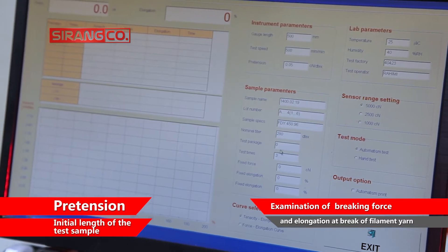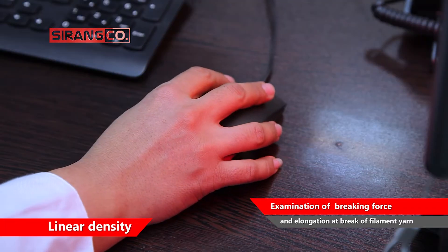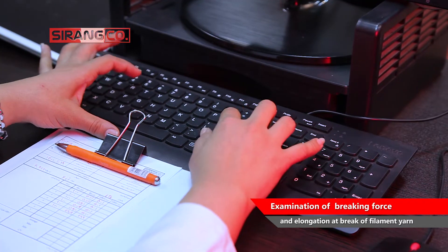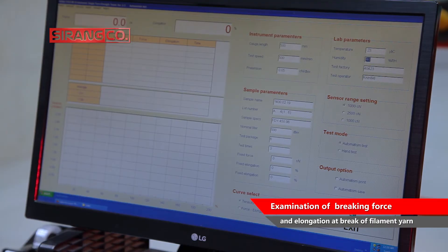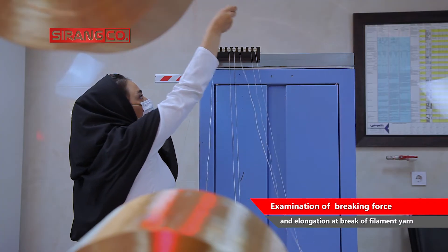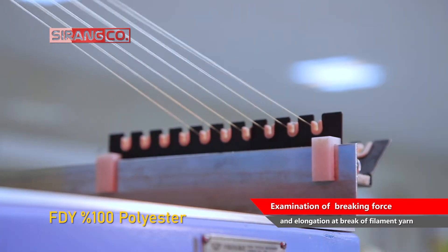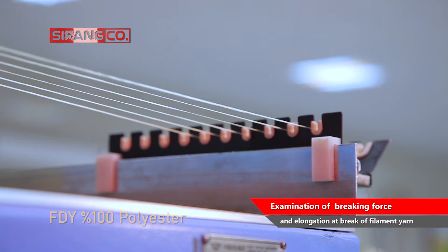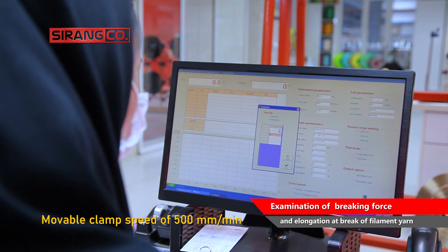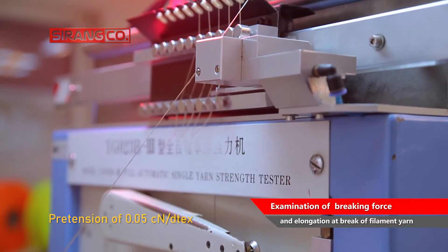Among the parameters related to this machine that must be adjusted before the test are the pretension, the initial length of the test sample, the speed of the movable clamp, and the linear density, which is adjusted according to the relevant standards. For example, to measure the breaking force, elongation at break, and work of rupture of 100% polyester FDY yarn with a certain density, a gauge length of 500 mm, movable clamp speed of 500 mm per minute, and pretension of 0.05 cN per dtex are set.